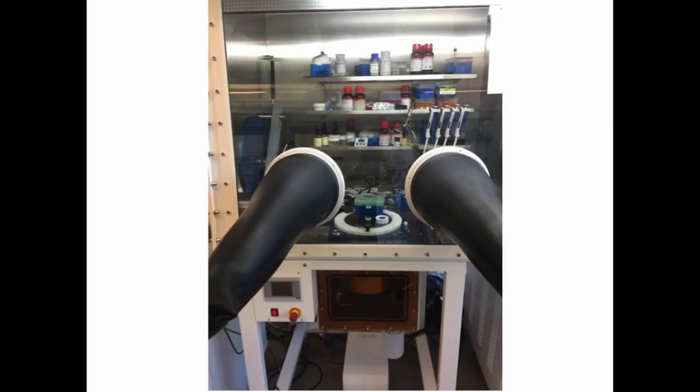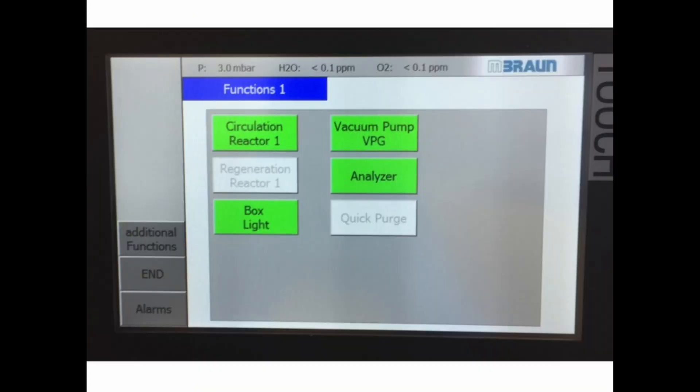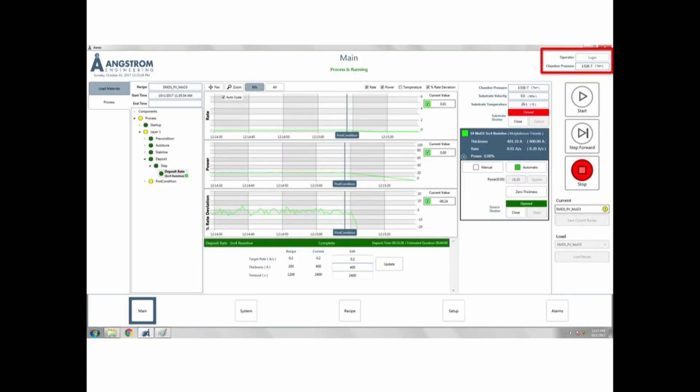This spin coater is located inside of a nitrogen glovebox. Before using the spin coater we must confirm the glovebox is ready to be used. First, let's confirm there is sufficient nitrogen pressure, the oxygen and water levels are below 0.1 ppm, and the thermal evaporator is under vacuum.